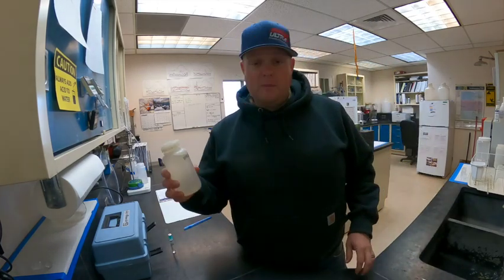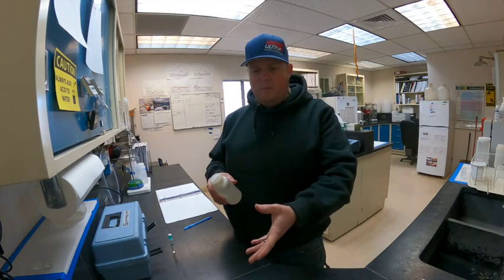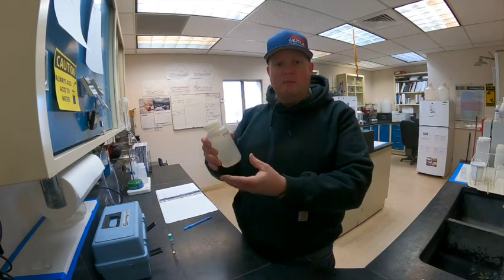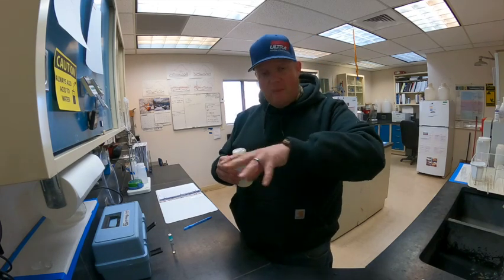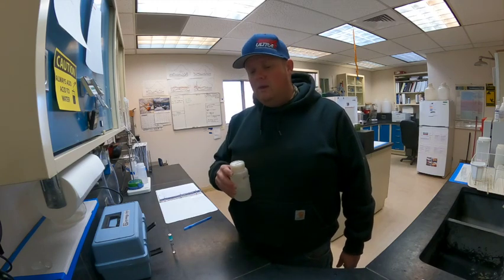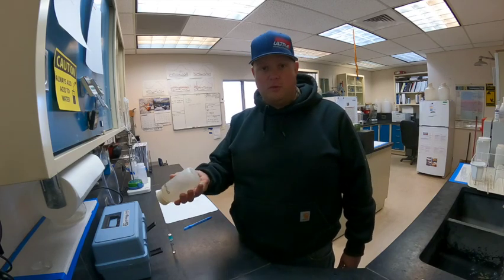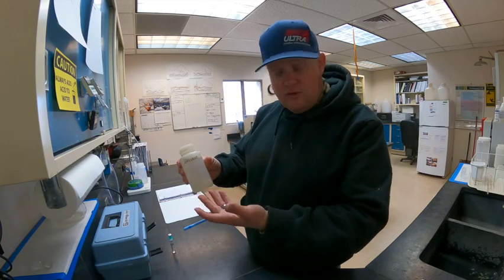Why do you cap your sample bottle securely? Well, I'll tell you why. Whenever you take a sample out, a little aliquot out to run somewhere, you always have to remix everything. When I'm in the lab, our lab SOP is three times. 1, 2, 3. Some of us are a little more vigorous than others, but the standard is like a 1, 2, 3.